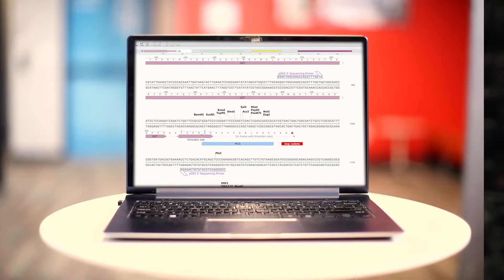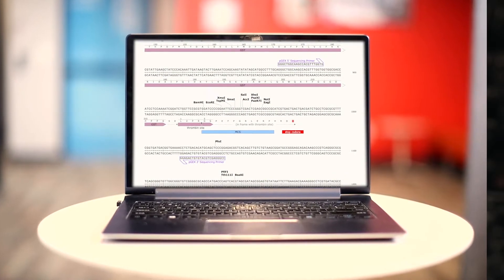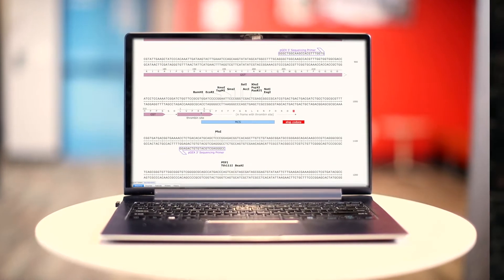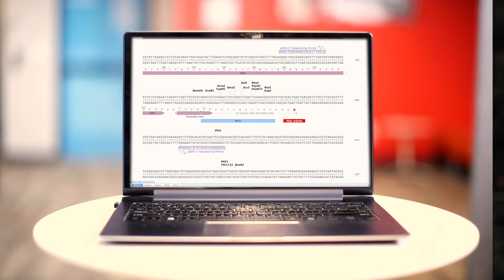The second problem is visualizing what you're doing — how you're going to cut and paste these pieces of DNA, and what tools you're going to use to perform those operations. SnapGene has a rich, intuitive visual interface that allows you to literally see what it is that you're going to be doing.